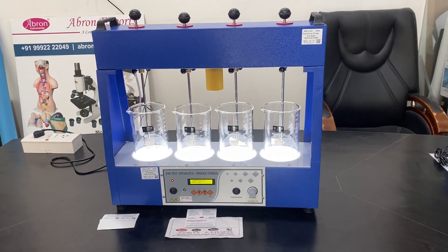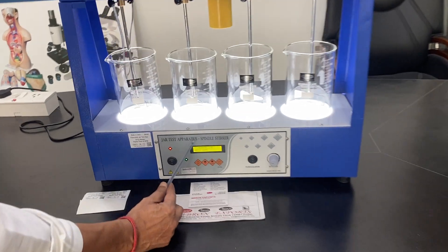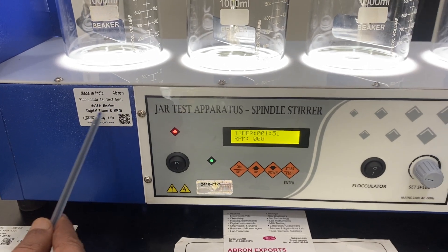Welcome to a video by Abraham Export. This is a jar test apparatus, also called a spindle stirrer or flocculator jar test apparatus.